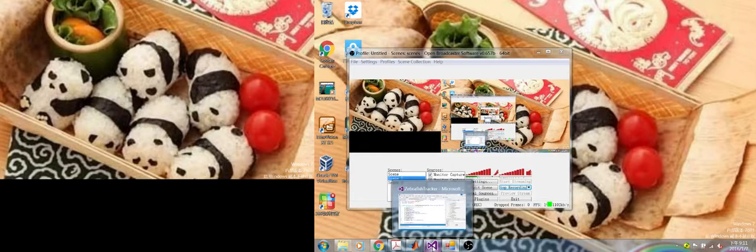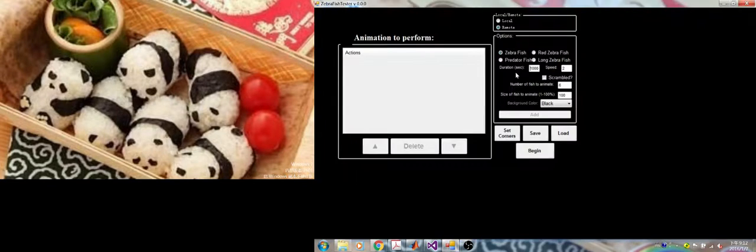So we can first configure this software, which is the software that is used to present stimuli. Here are two options. One is local, which is the original software that we're using to present stimuli, by the way, the stimuli are zebrafish. And the remote is the new function of the software that is used for my project, so that it functions as a server and receives signals from my software.